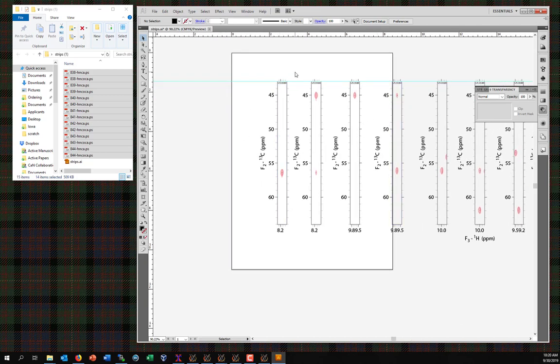The same would go with all of this stuff in the middle. Like, we don't need to label the y-axis on all of these, right? And so I can go in and just start deleting those. We'll probably keep one on each end.